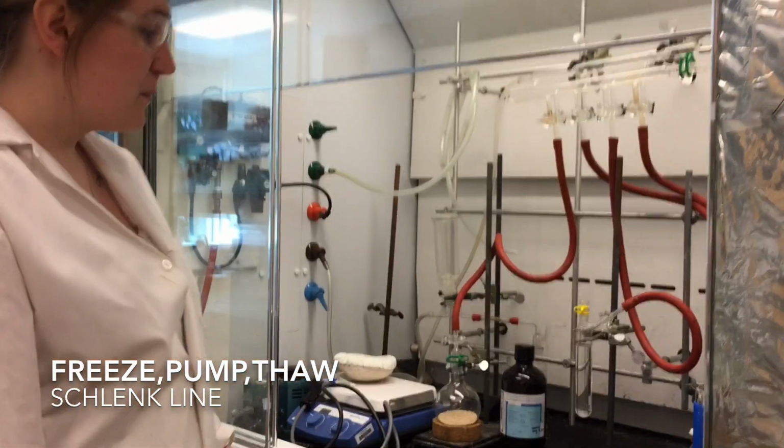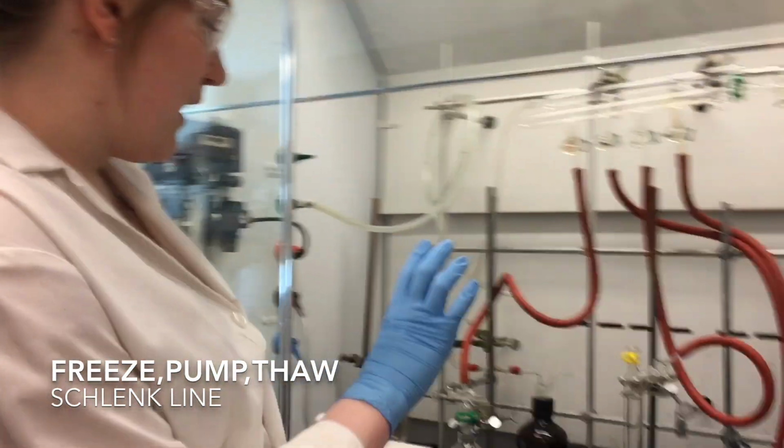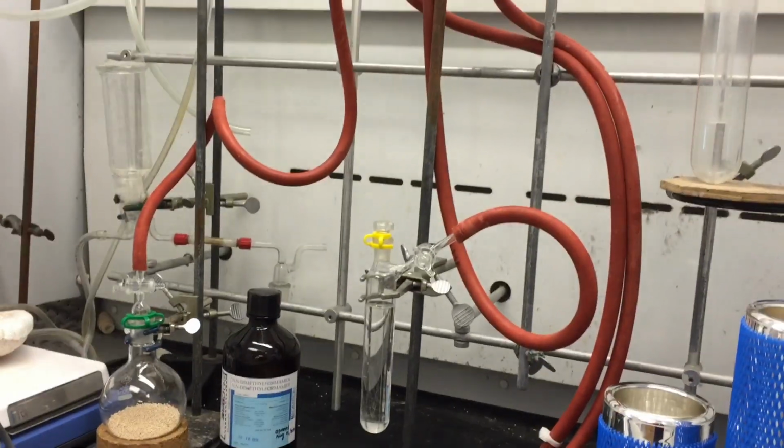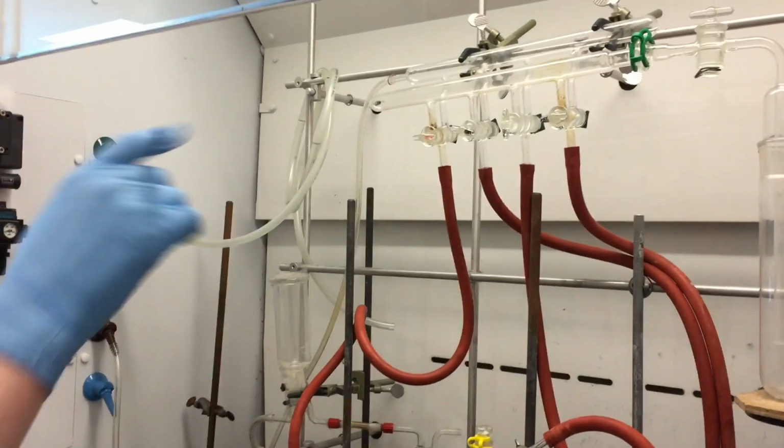So today I'm going to be freeze pump thawing a solution. It's in N,N-dimethylformamide, or DMF. I have my solution here and it's in a Schlenk flask and it's attached to the Schlenk line.